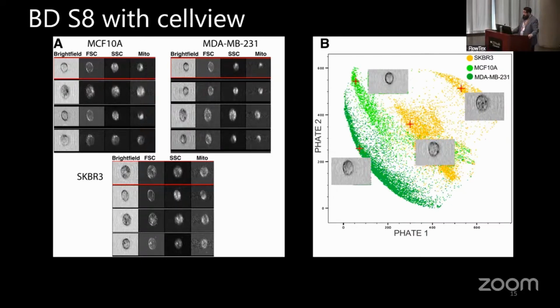What we're seeing is an axis here shared between the triple negative breast cancer cells, the dark green, and these SKBR3, which is more HER2 status changes there. Along this axis, though, you're seeing these dark spots, and it's similar, albeit different spatial organizations. And you're not seeing the MCF10A normals in this axis or at very low amounts.